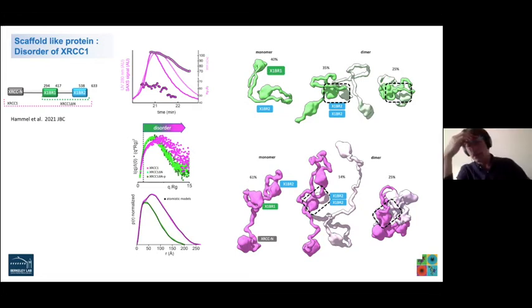Are you talking about lipid nanoparticles? No, these are all protein-based, but they're multi-component. Do you mean some kind of apoferritin cages? Yeah. I will show an example of apoferritin because there was one user who was explicitly asking how we should analyze this data. Yep, that was me. I will show that, and I think the separation is perfect because your size from the molecular weight is relatively small.